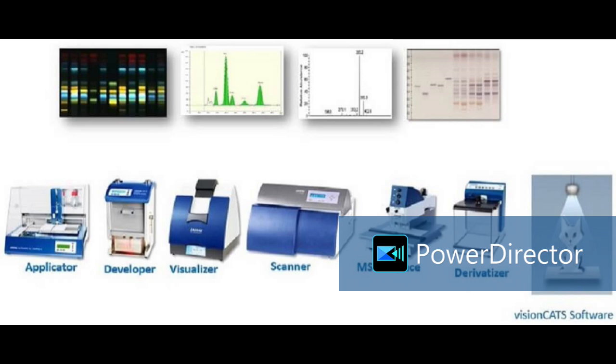A couple of questions here. If you say this is the evolution, now most of the time the new eras are promoting nanotechnologies or rather miniature technologies, isn't it? Yes, because I may not have that much space in my lab. So I want a miniature version of it with all features of the traditional one. Then the other thing is the throughput as far as the samples are concerned. High sample throughput, because as a forensic person, I want many samples to be tested in one go. So what is the evolution in that direction?